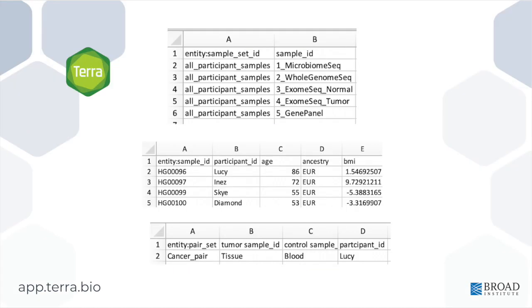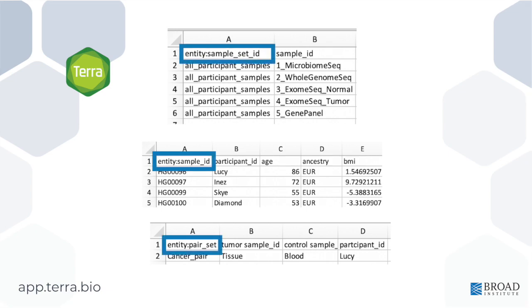Our support center describes this concept in more detail, but for the purposes of this tutorial, we only need to understand three things. Number one, every table has one entity type. Number two, the entity type is determined by the top left cell of the spreadsheet, which must contain exactly the following characters.